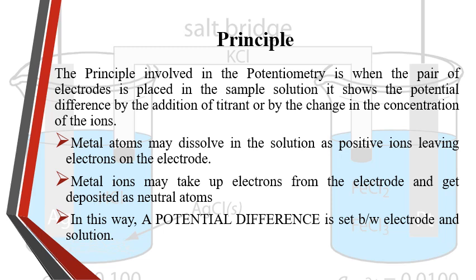Now, during this titration, the active ingredient being determined produces an electric potential with a suitable indicator electrode. The titration is followed by the fall in potential as the ingredient is used up by the titrant. The titrant may cause production of potential at the end point when the titrant is no longer being used up by the active ingredient. The sudden increase in titrant concentration results in a sudden increase of potential.